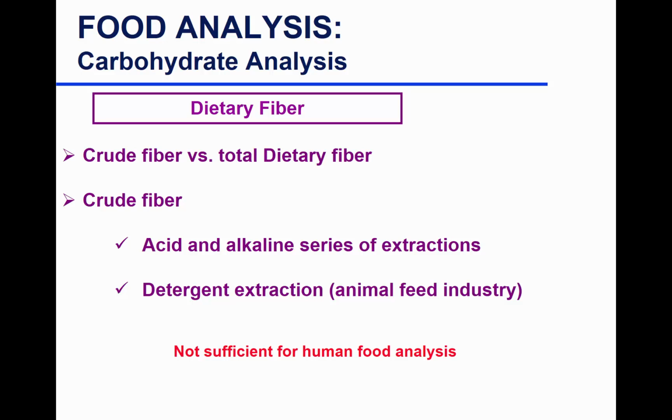But you will lose the soluble fiber. So you're only measuring really here cellulose, hemicellulose, and lignin with that. You can't measure hydrocolloids or pectin. So it's an incomplete quantification of your fiber. The detergent extraction is also the same issue.